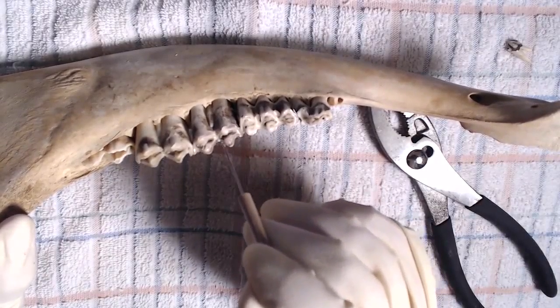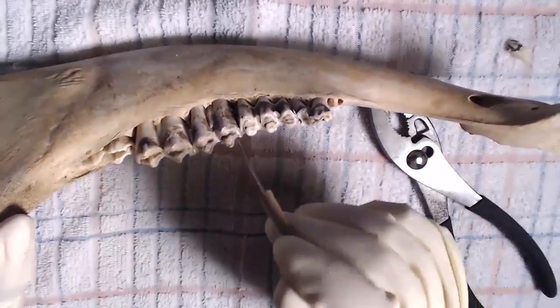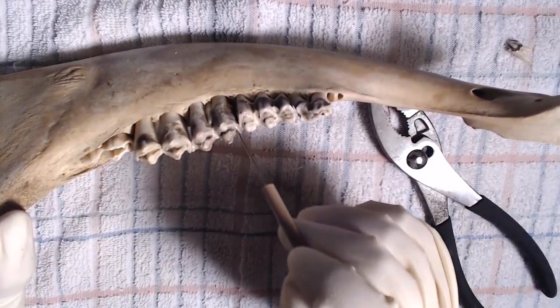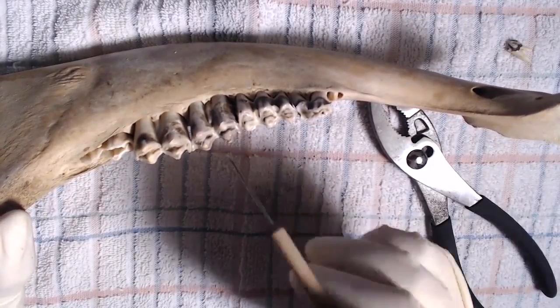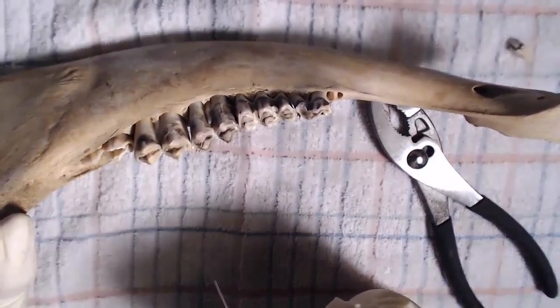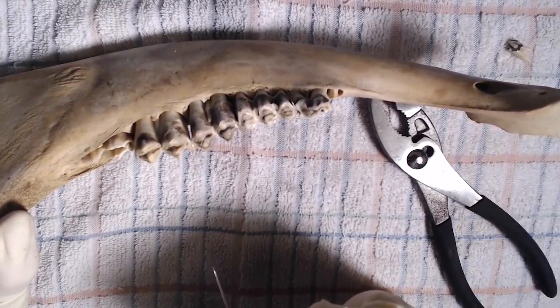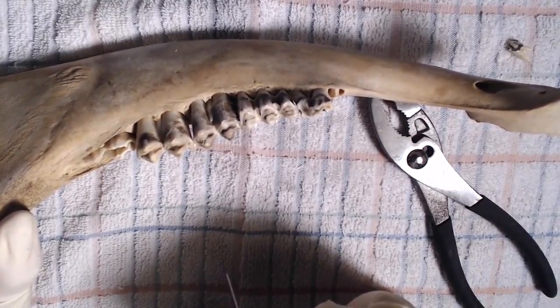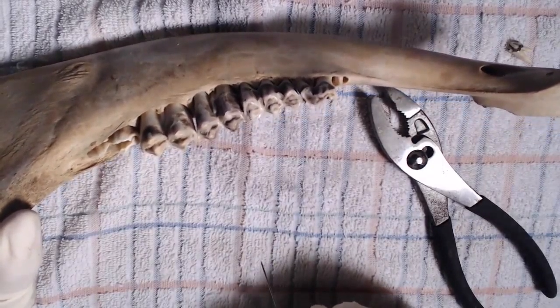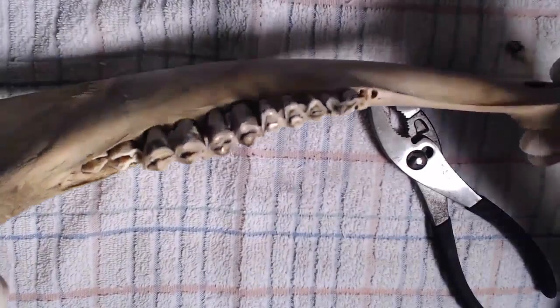And that's where all the blood vessels and nerves were. Okay, so we have the enamel on the outside, dentin in the middle, which is kind of orange, and then the pulp right in the middle of the tooth. Okay, so hopefully you were able to identify all of those structures.